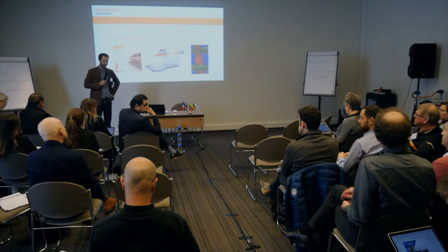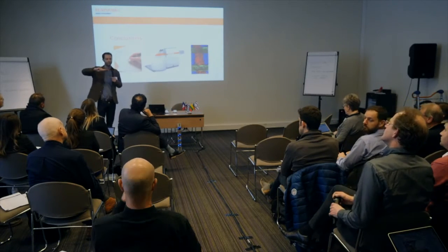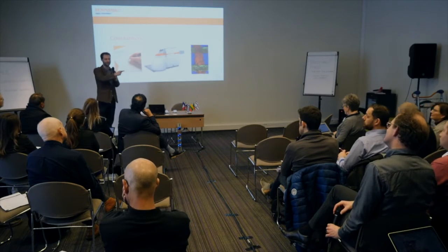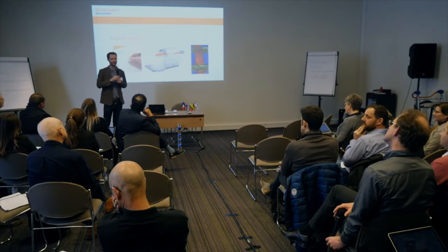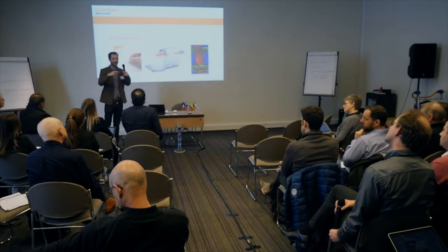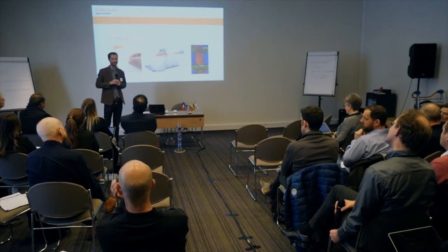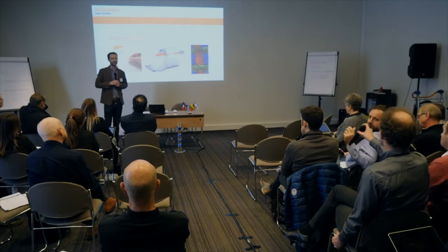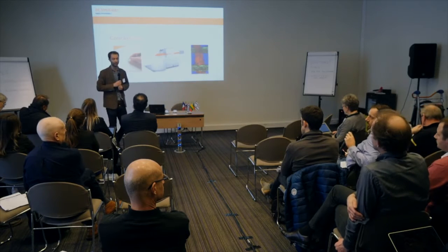The technology for the mapping stages is actually quite old-fashioned in a way. This is an infinite screw that drives the stage in and out, and there's a lot of friction with such technology. And effectively, since it's feedback controlled, you just keep on looking for the position. It goes left and right until it finds the position. That's why it's actually tricky to get 1 micron repeatability on a stage.